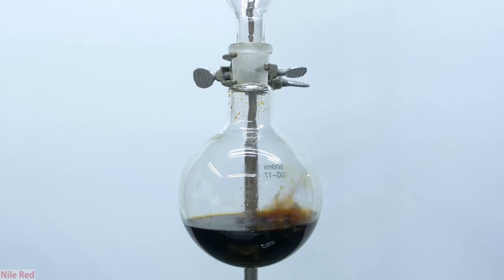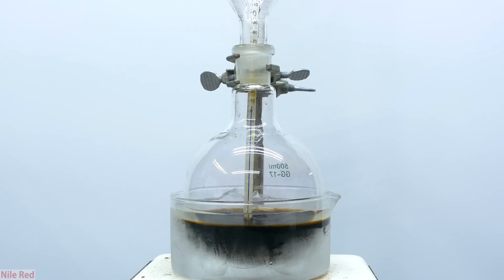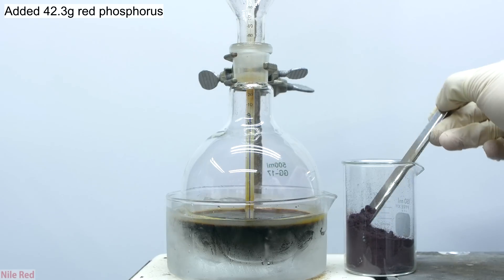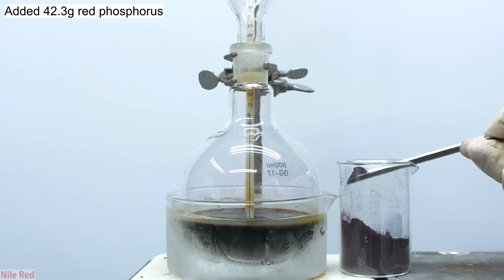The next thing that I do is drop in a stir bar and set up an ice bath. Once everything is stirring, I add in 42.3 grams of red phosphorus in small additions.